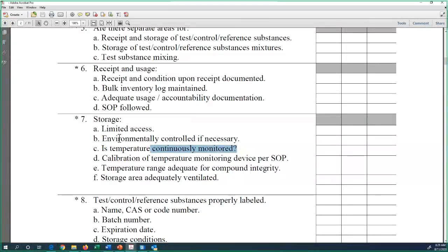It's interesting. We put our standards, the pure standards, in the freezer. We have a special freezer, just a freezer for that. We get a lot of questions from the inspectors, from QA. It says 4 degrees and lower, why do you put it in the freezer? So as long as you can control them, there's no contamination, there's no humidity inside your sample, no condensation, that's fine. So it's better.